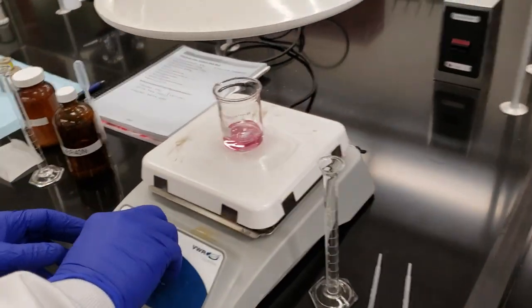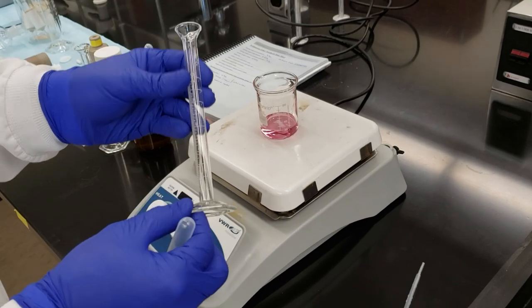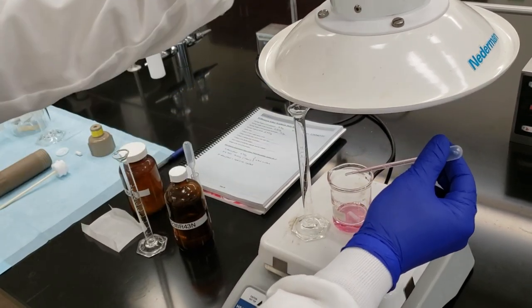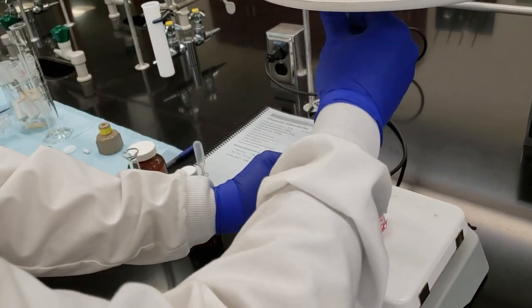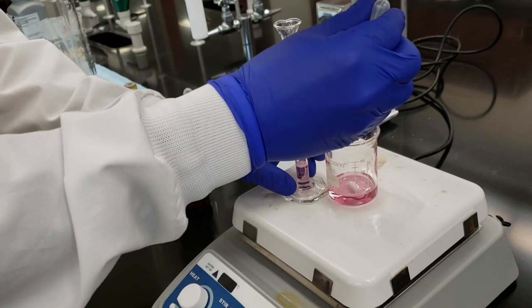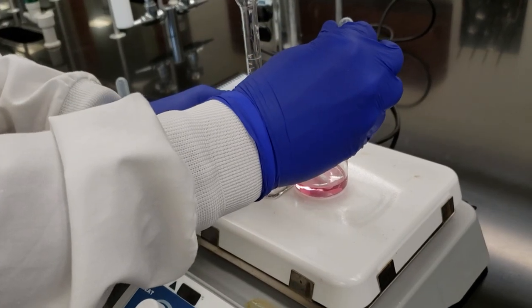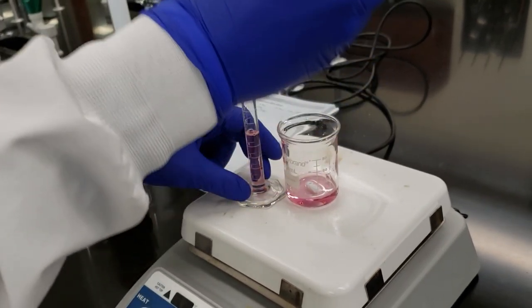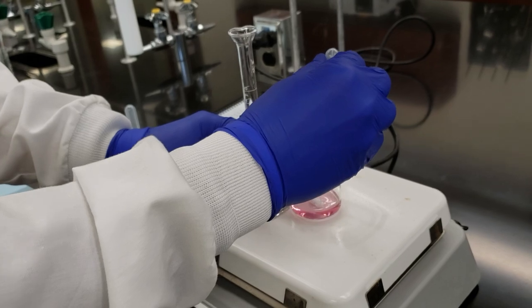Now let's measure out. I'm going to keep my snorkel in place because of the strong odor of our solution here, but I'm going to measure out 8 milliliters of this solution. Move this just a little bit up. There we go. We'll use our pipette here and measure out our 8 milliliters. Once we're done adding this into the graduated cylinder and into our Teflon vessel, we'll go back and review our data sheet.